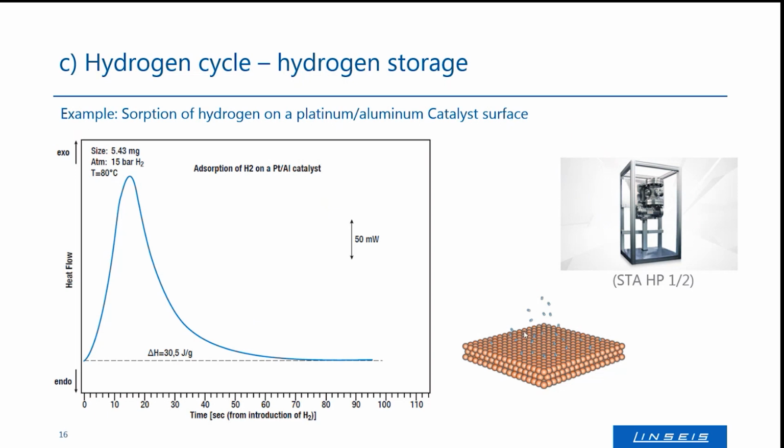This sorption and desorption process is a process where you can measure and detect the released or consumed energy as an enthalpic signal. If you put a piece of it into a DSC crucible and measure the heat flow, you see the amount of heat that's released during sorption and that's required for desorption. And by knowing this enthalpy, you can calculate how much temperature you would need to adsorb or desorb, and especially desorb, a decent amount of hydrogen. So that's what we did on the one hand.